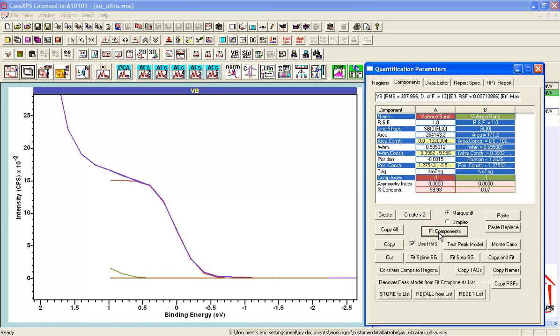When I say fit, I end up with a step function that looks much closer to what you might expect, and the excess signal is being allowed for by the Gaussian.